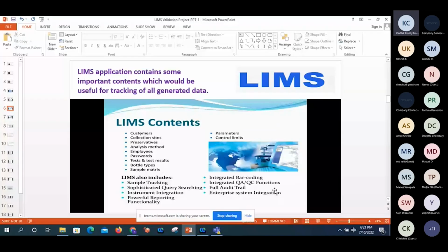LIMS has the provision for manual lot creation as well as automatic fetching from SAP to LIMS. There is PI, the process engine. From SAP to PI, the lot will be transported, and after that from PI to LIMS. Once the lot comes, as I already explained, the complete laboratory process from lot creation up to COA generation follows. This is the enterprise system integration.